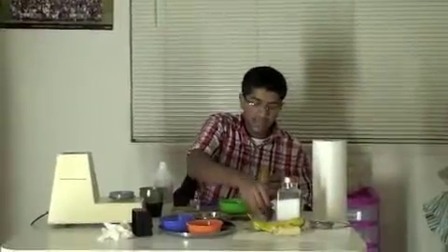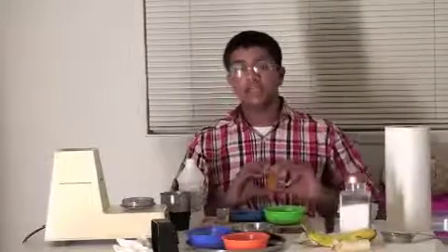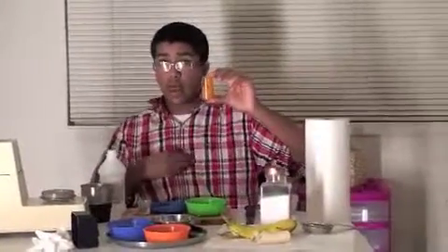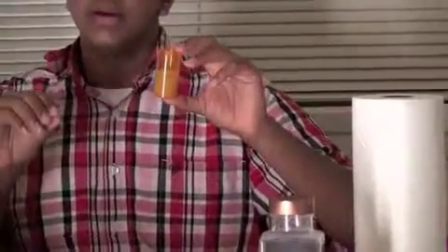And now that's the end of the experiment. You can just do whatever you want with the DNA. This is our conclusion. As you can see, there was clearly more DNA in the banana. My conclusions, along with Aditya's, are that even though we used the exact same procedure, we got different results. The only variable in this experiment was the types of fruits. And we can clearly see the banana yields more DNA. All of this, suspended in the clear liquid, is DNA. We come to the conclusion that the banana holds more DNA. And this may be due to the fact that it's more condensed versus the orange, which is less condensed.